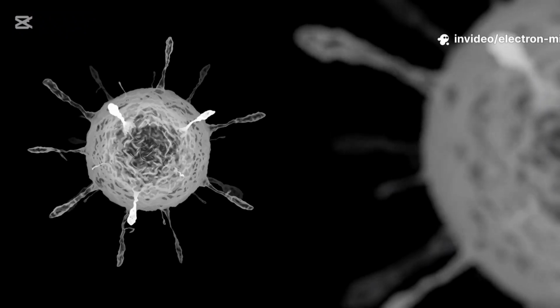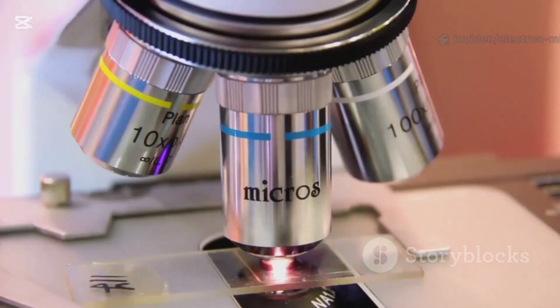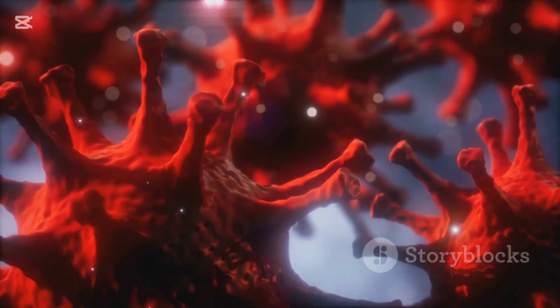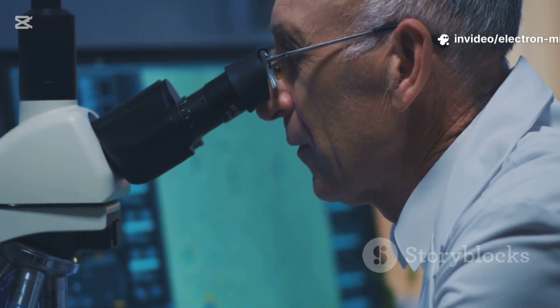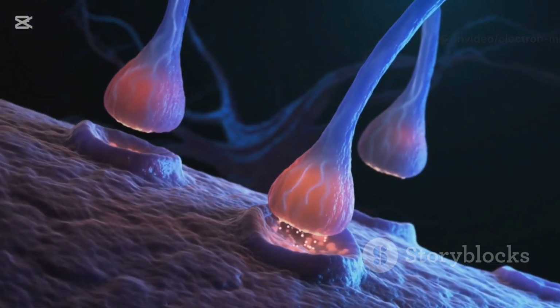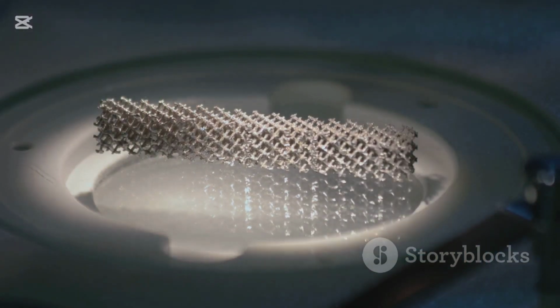With light, you see a skin cell. With electrons, the mitochondria, then the folded membranes inside. At the frontier, even large molecular arrangements. So beyond big numbers, a scientist asks, what's the resolution? Can it resolve virus spikes or a hairline crack a few atoms wide? Resolution is the key that unlocks the deepest secrets of the small.